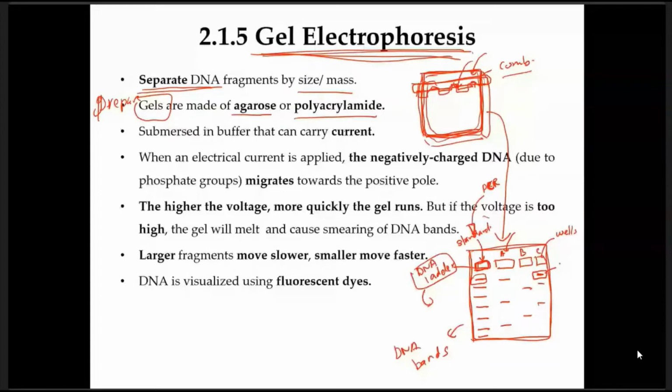Okay. Through this process, through gel electrophoresis, you cannot determine the DNA sequence. Awak tak tahu sequence dia apa, kan? So nak tahu sequence dia apa, you cut the gel that contains your DNA, you send to a company that can analyze your DNA sample, that can give you the DNA sequence.